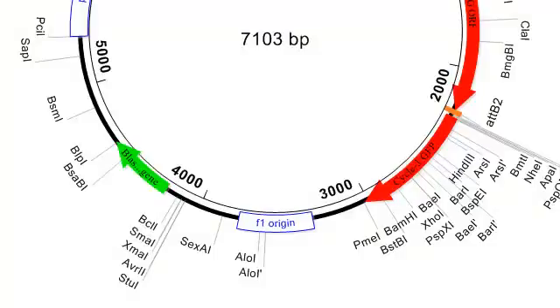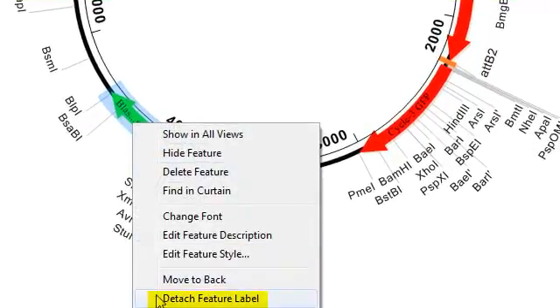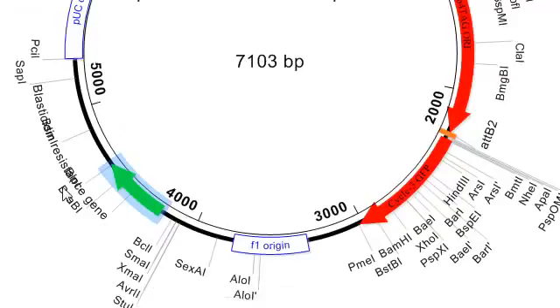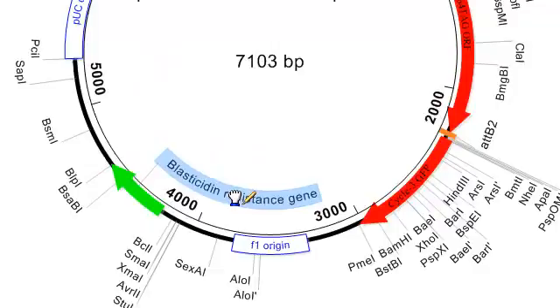You can also reposition the labels for individual features. For example, the name of this feature here is too long to be fully displayed within the feature. So, what I can do is first select the feature by double-clicking on it, and then right-click and choose Detach Feature Label. And as you can see, that moved the label outside of the feature, and now I can just drag it to wherever I want it to be displayed.